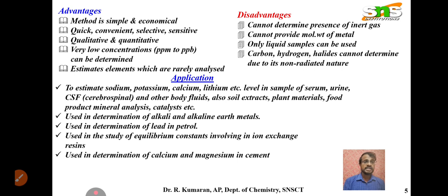Such a versatile technique it is. Even though it is very sensitive, it can be applied everywhere. For this reason, it is highly appreciable to use this flame photometer.